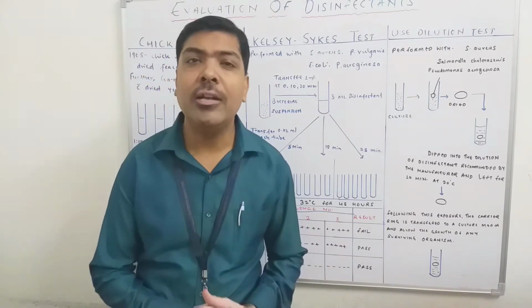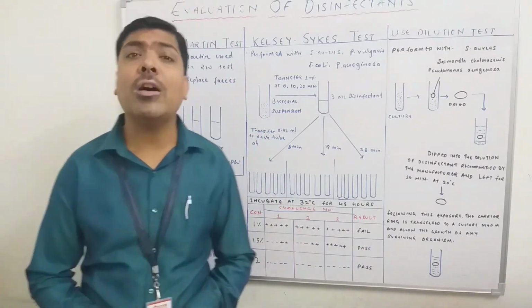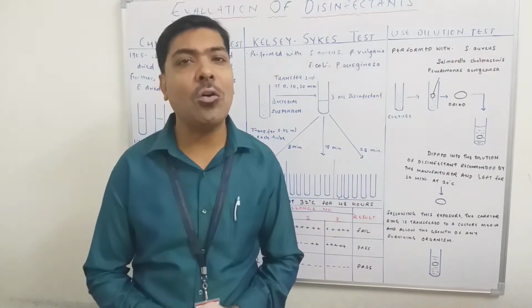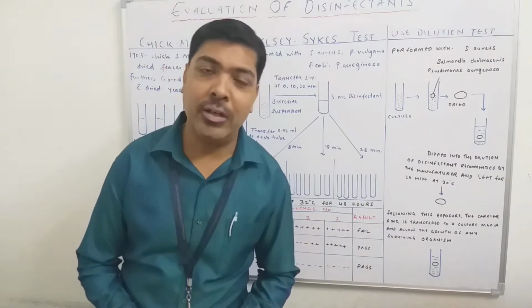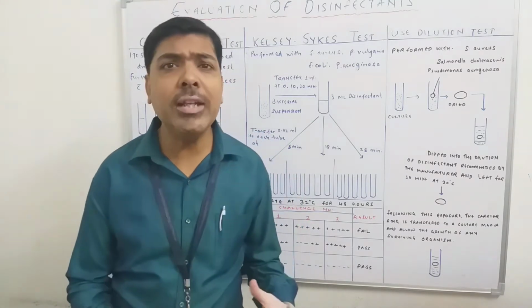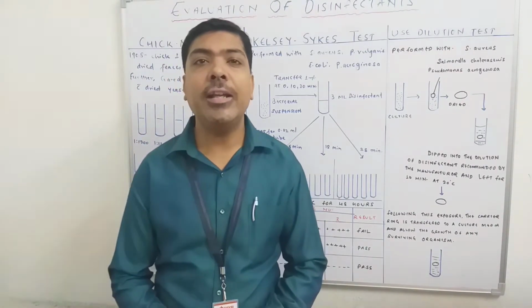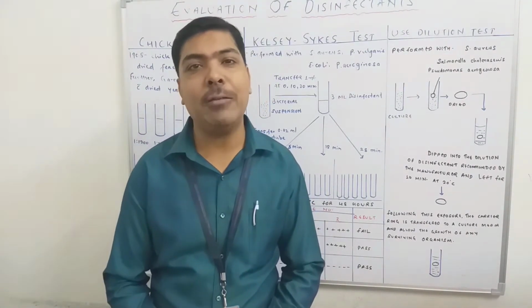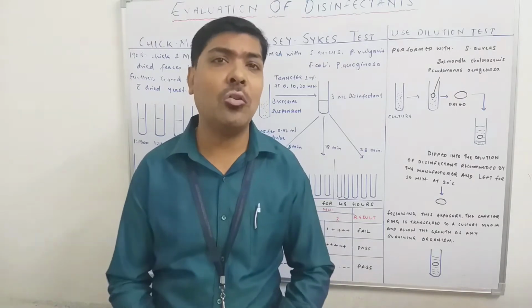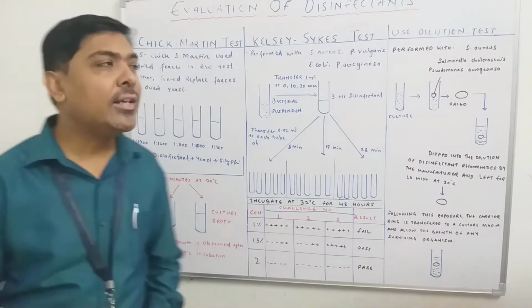But in that solution, we are taking only the disinfectant. Especially in a hospital or a pharmaceutical industry, organic matter is definitely present. In a hospital, urine, feces and blood are also available. If we apply the disinfectant in areas where the concentration of organic matter is very high, the disinfectant should be capable of killing all microorganisms even in the presence of organic matter. This point was raised by Chick and Martin.